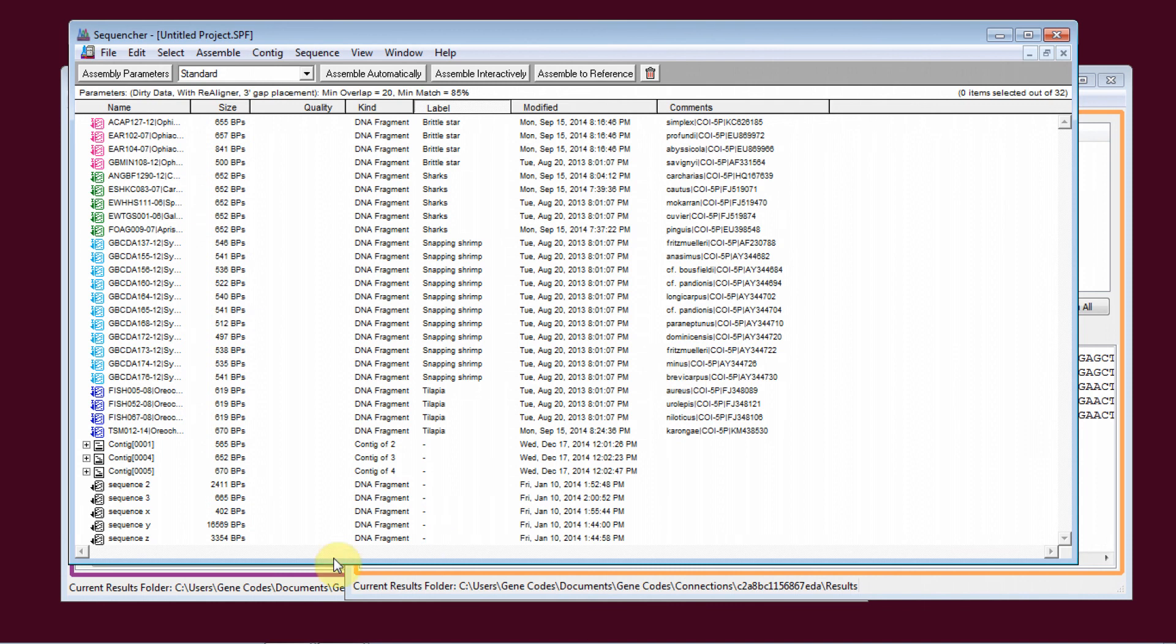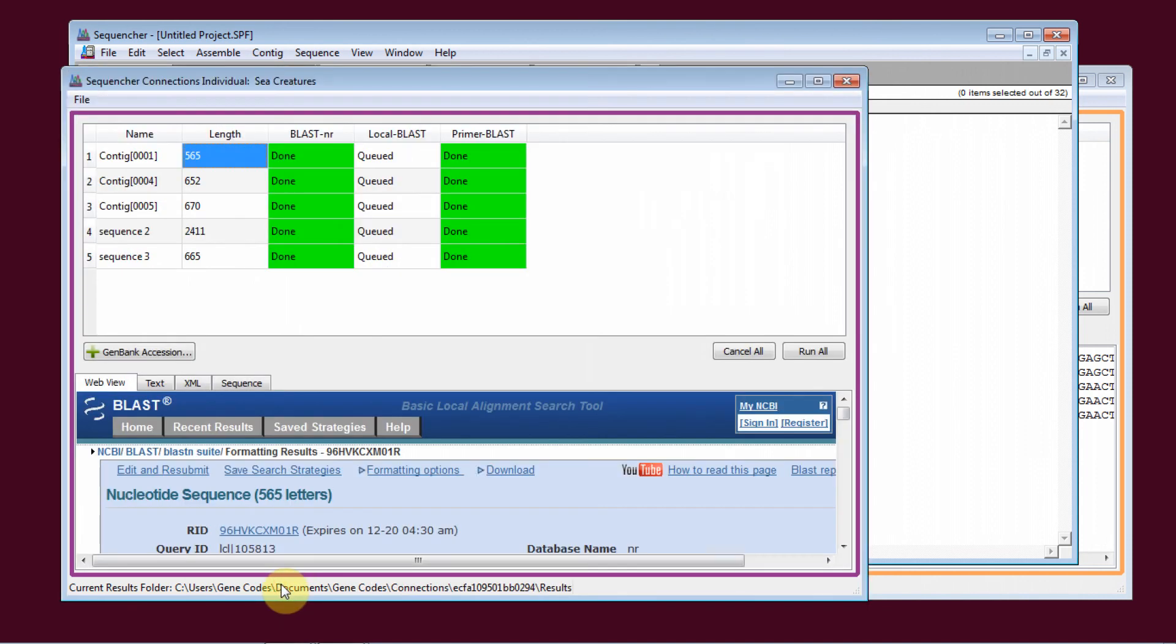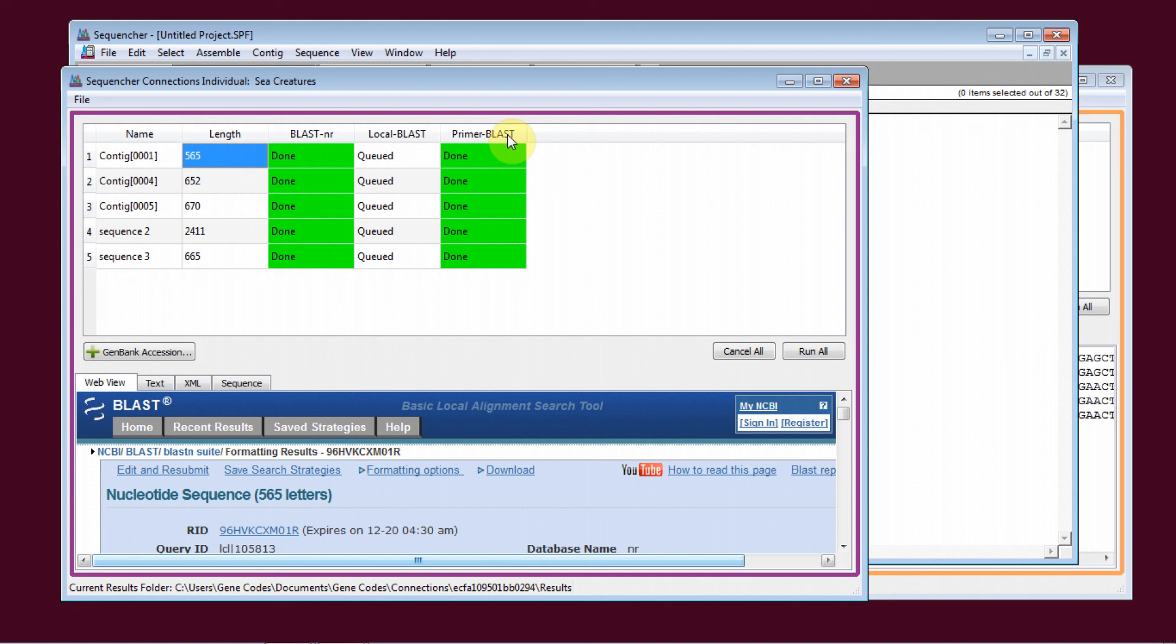For individual sequences, you can do BLAST searches of the NCBI databases, local BLAST searches of databases on your machine, and primer BLAST searches to design primers over a region of interest.